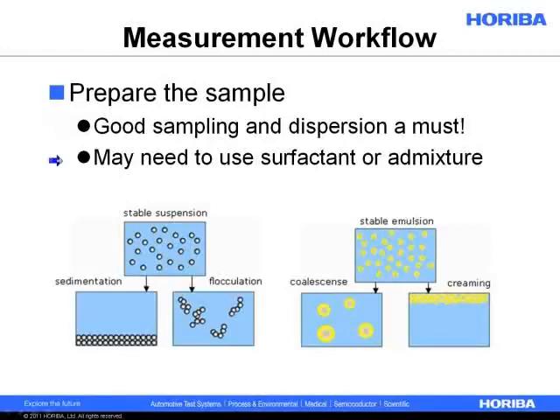It turns out that you may need to use a surfactant or an admixture to either get the powder sufficiently wetted or to keep the particles suspended and adequately dispersed. And we just have a few graphics here of what good dispersion should look like. You don't want your material to be sedimented when you add it into the analyzer. If it is, you need to mix it up, make it look more like this. You certainly don't want your material to be flocculating, or if it's an emulsion, you don't want it to be coalescing or creaming. These are not good dispersions.